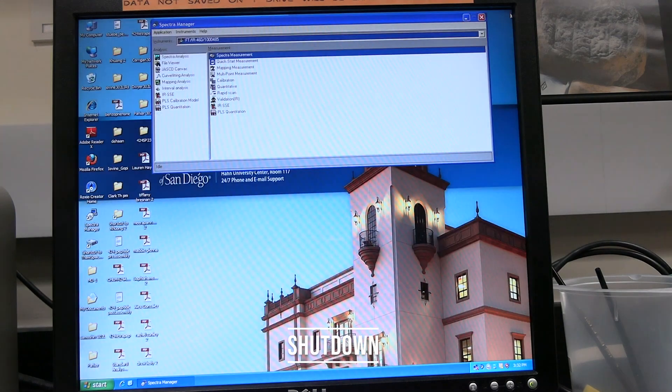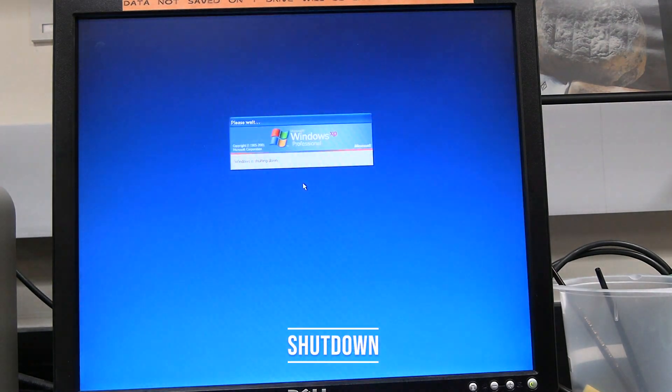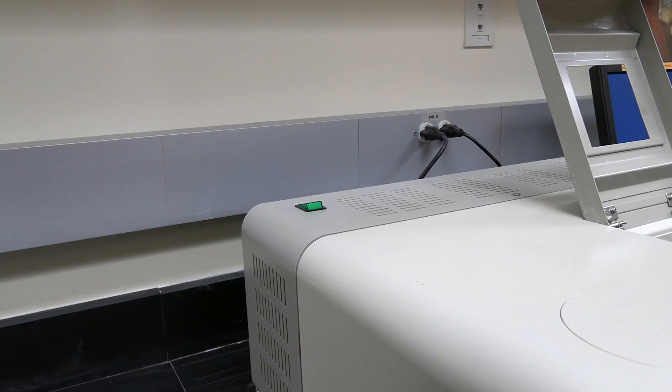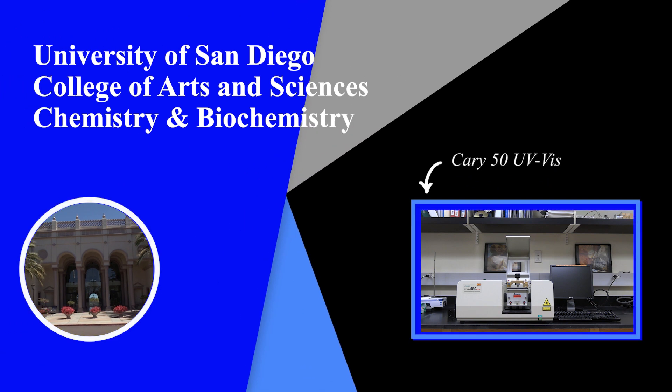Shut down. Close all the software. Shut down the computer. Flip off the power switch on the top left back corner of the instrument. The switch light will turn off. The instrument SOP should be located next to the instrument. If assistance is needed, please look in the instrument SOP for the contact information of the scientific instrument specialist.